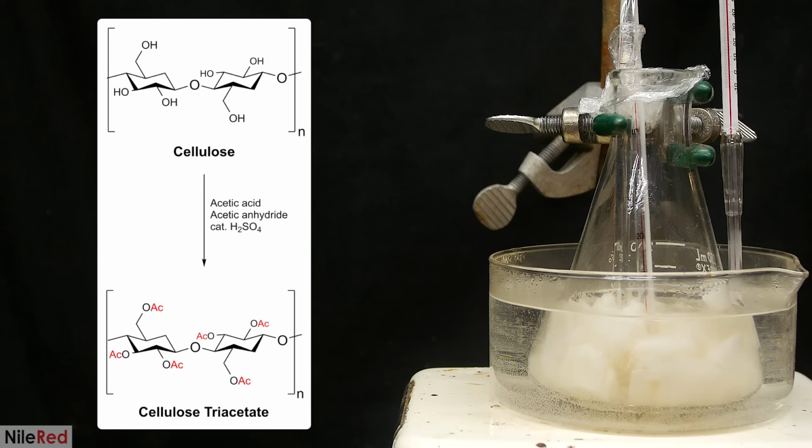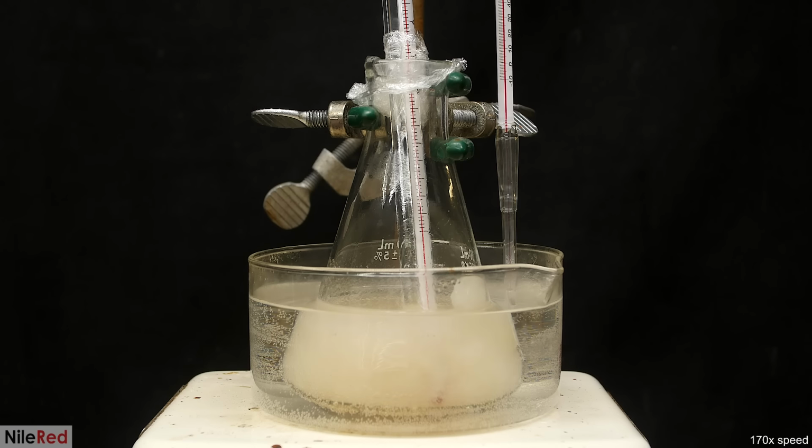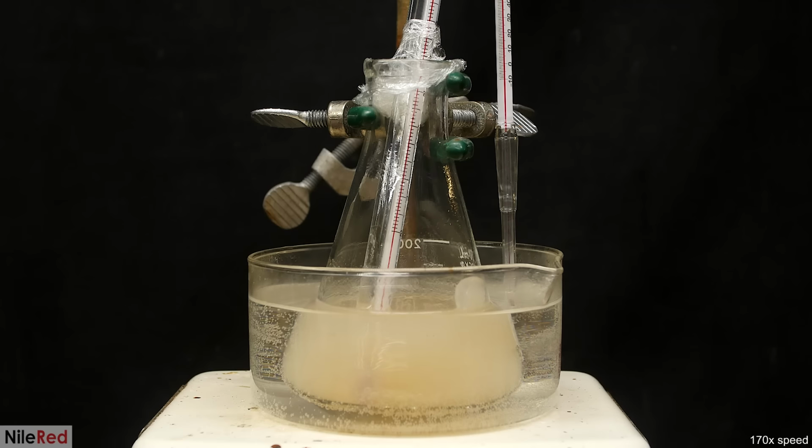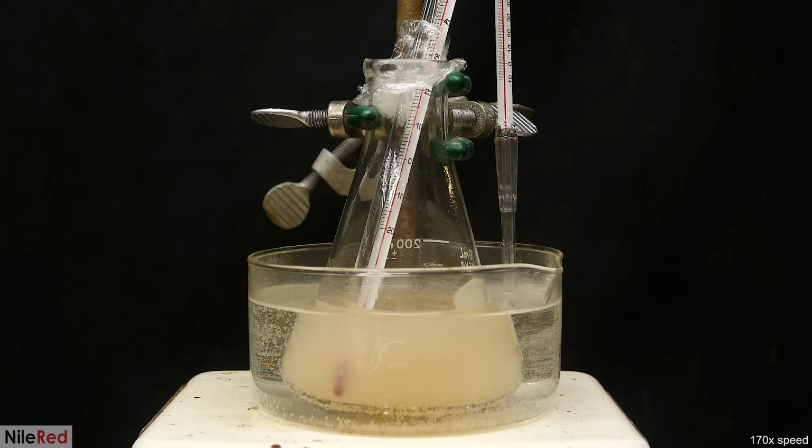Each glucose subunit has 3 hydroxyl groups, and almost all of them will get acetylated. This type of reaction is known as an esterification, and it leads to the formation of cellulose triacetate, which is soluble in the acid mixture. So, as the reaction progresses, all of the paper should slowly disappear. If it doesn't, it's probably because the pre-treatment wasn't done properly. I did a couple runs before this one, and I found that if I didn't coat the paper really well, there was a lot left over.